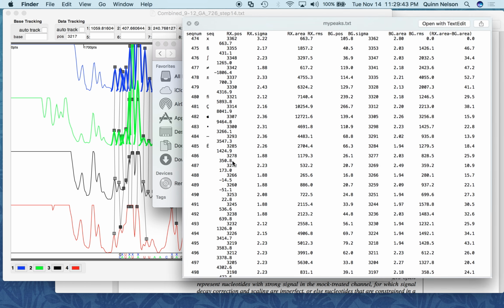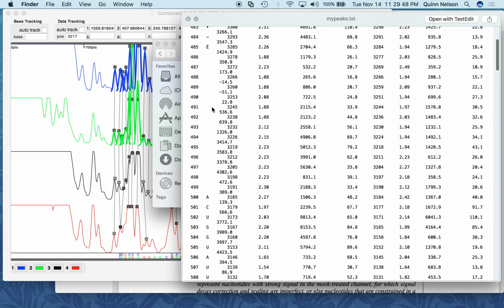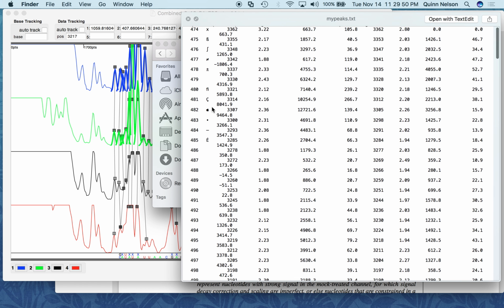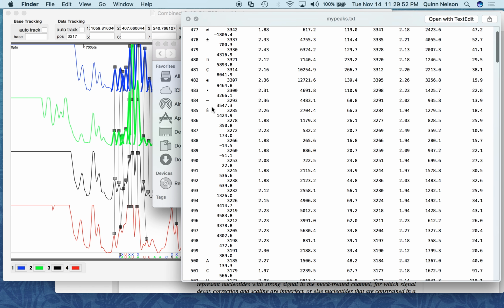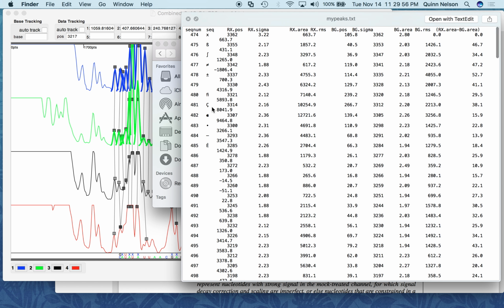And now we'll look at the alignment. Okay. So this is interesting. This is very interesting. It started at sequence 474. And it's saying x beta integral not equals plus or minus phi, I don't even know, the apple sign.